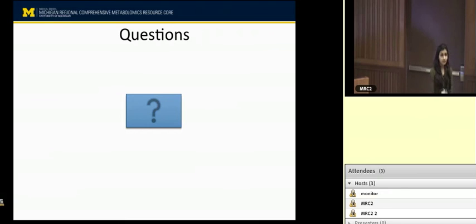That's the reason I combined these data sets, because most of the time people used to come back and say, how do I do this? What do I do with this data now? How do I pick which one I want to pick? So I think that's why I have combined it. But you are free to look at it yourself. And if there is another way you want to look at these things, especially if you want to check some of the compounds that are coming in both positive and negative mode, it's a good way to check your data.